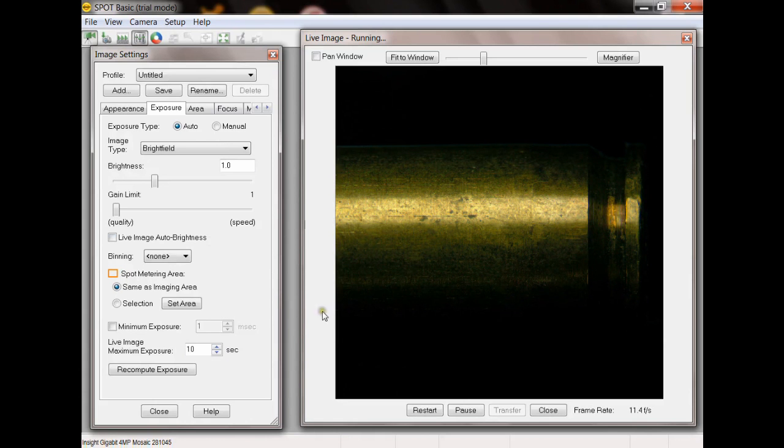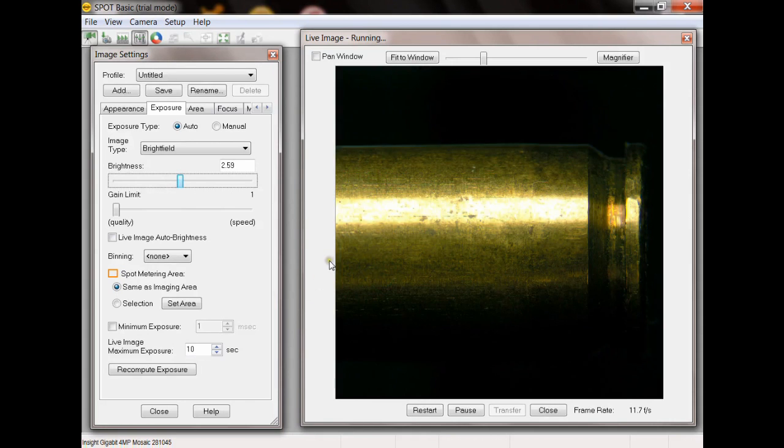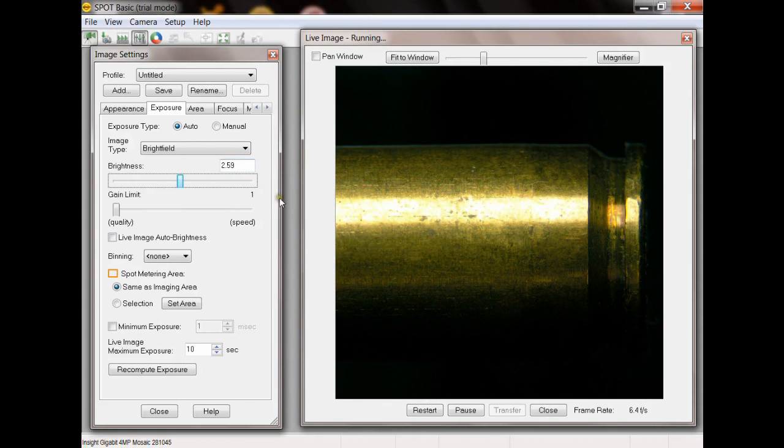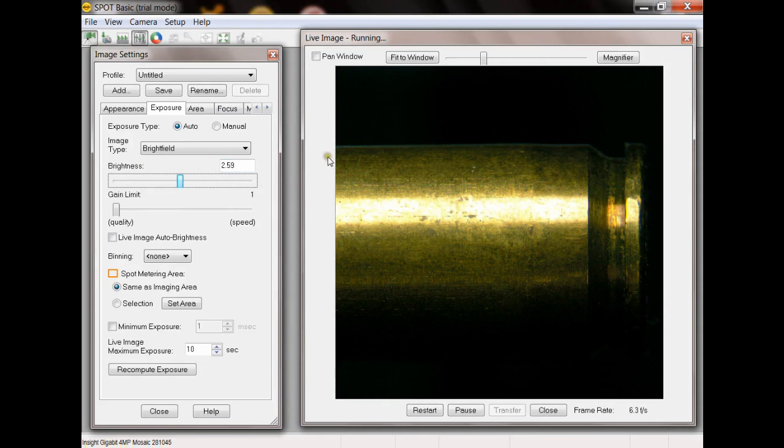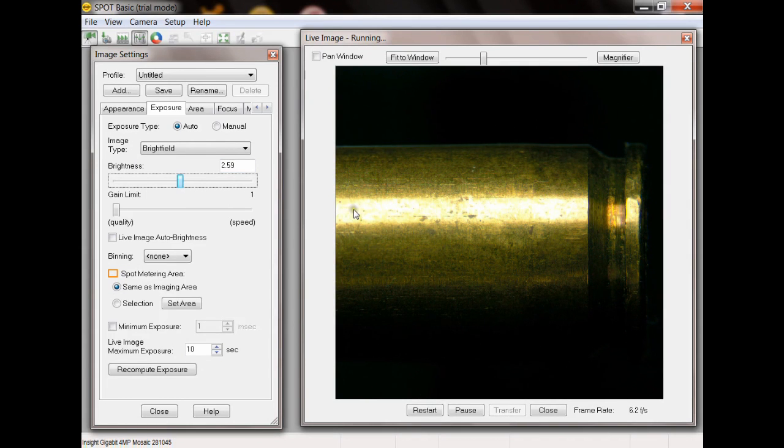So what can I do? If I increase the brightness up at a brightness level above one, it allows pixels to go to overexposed. While it increases the detail in these formerly darker regions, the middle now is way overexposed and I don't see the detail I had before.